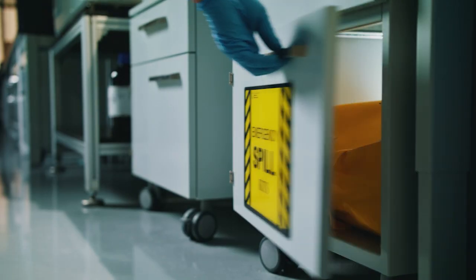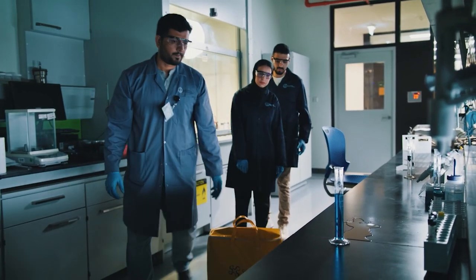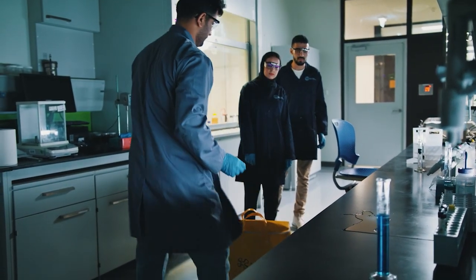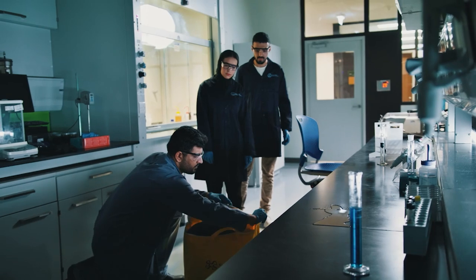If a significant amount of flammable, toxic, or volatile material is spilled, it may be necessary to vacate the entire laboratory or building. If a small spill of a liquid material occurs, your instructor may direct you or others to use this spill kit. Before you deal with a chemical spill, make sure your hands and eyes are protected by wearing gloves and goggles. Firstly, take note of the direction in which the spill is flowing to establish the correct position of the absorbent pads.